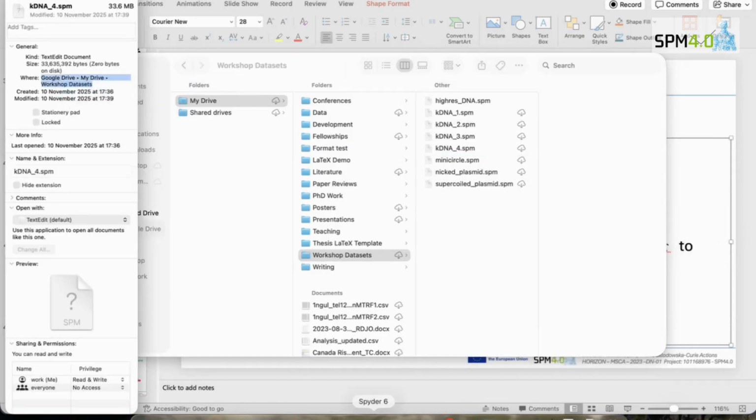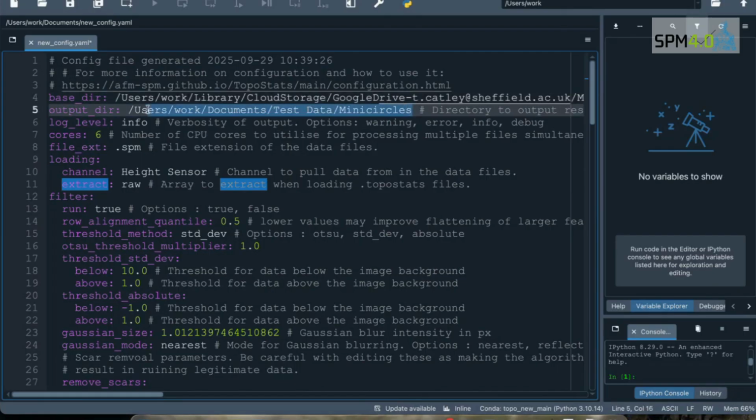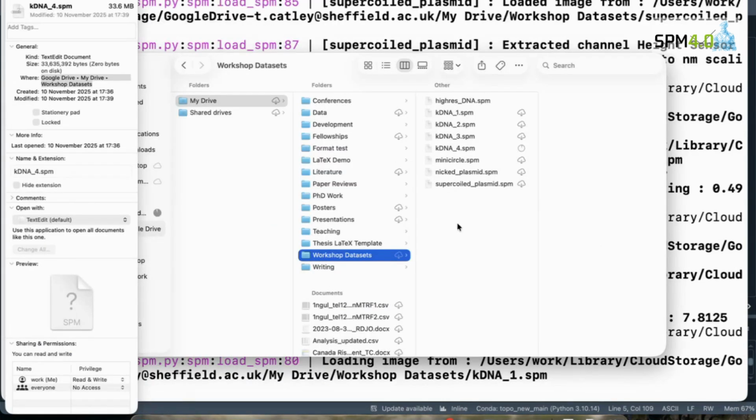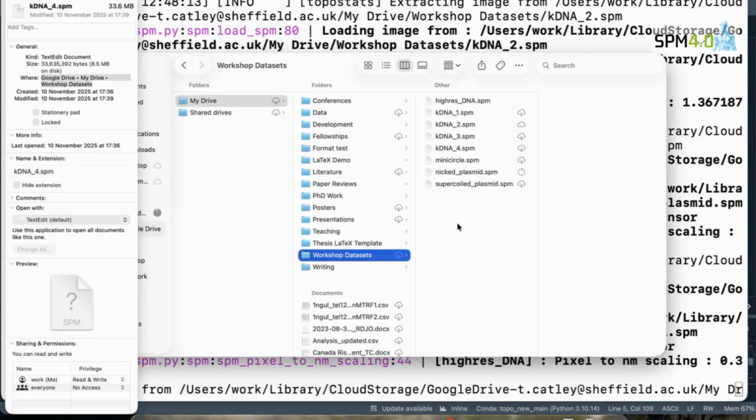He can download the PowerShell. But yeah, this has other extension, because I did it. So I was getting annoyed between switching between two different.